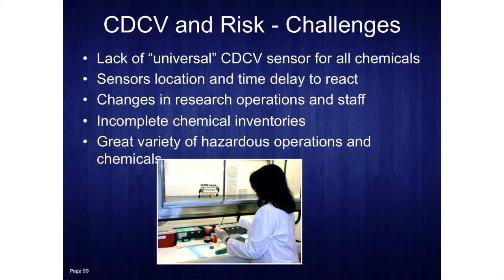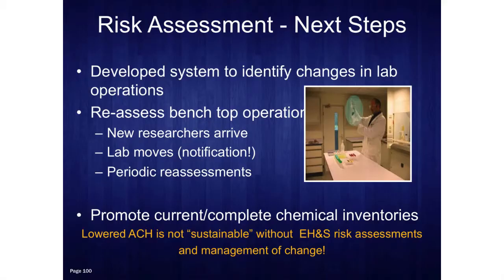But even if CDCV is not perfect and does not solve all your lab air problems, it can be a helpful tool for EH&S. And the Smart Labs program, if it does anything, it helps emphasize the vital role that EH&S continues to play to monitor changes in the lab environment, to perform ongoing risk assessment, to perform exposure monitoring, implement work practice improvements when necessary, investigate potential complaints, and provide training.